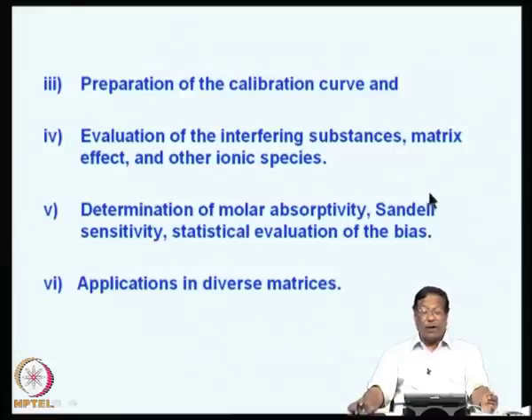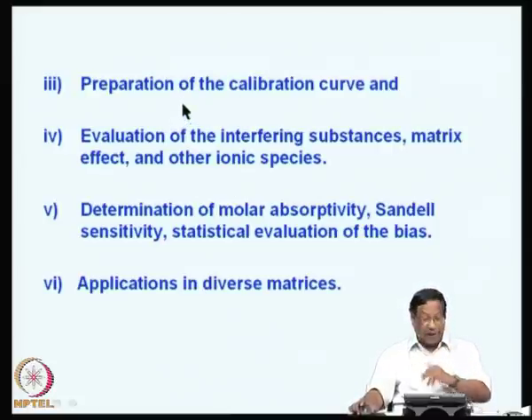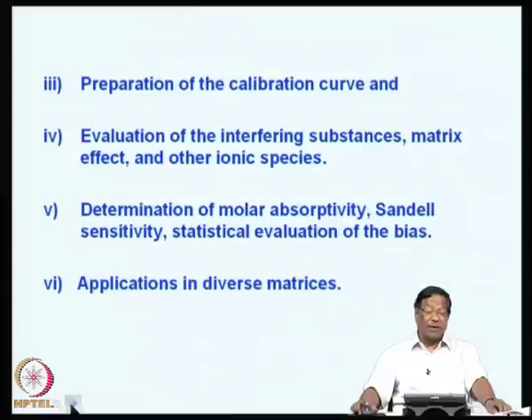So, you would also like to determine Sandell sensitivity, that is the sensitivity at the detection limit of 0.001 absorbance. What would be the concentration that gives you so much of absorbance. And then you may also like to evaluate statistically the bias. And if you develop a method including all these aspects, then you would like to determine the element in diverse matrices. That is another part of the research that you would like to be interested in.